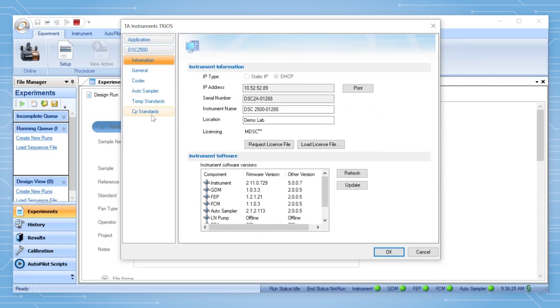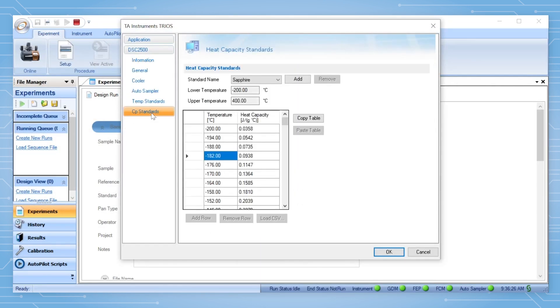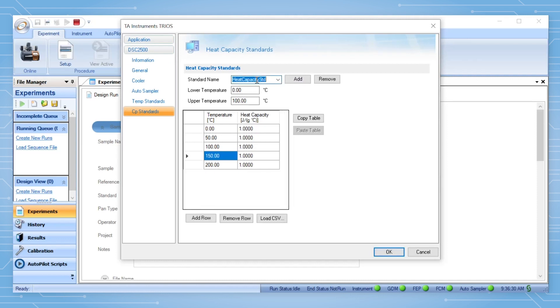For CP standards, after clicking Add, input the standard's name and the lower and upper temperatures to specify the temperature range in the experiment template.